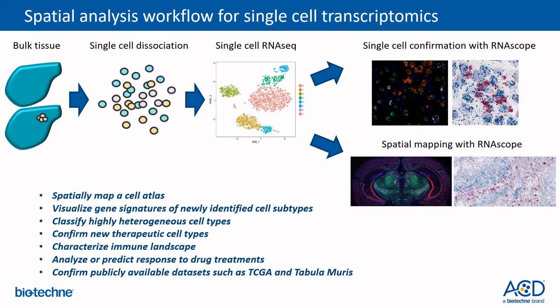So with these examples of organoids, I'd now like to move into single cell research. As I talked about before, single cell research has really just shot up in the last couple of years, given the importance of studying single cell transcriptomics in the field. We're seeing more and more customers performing single cell analyses to reveal the heterogeneity in complex tissue organs. So initiatives such as these transcriptomic cell atlases require assessing gene expression at that single cell level.